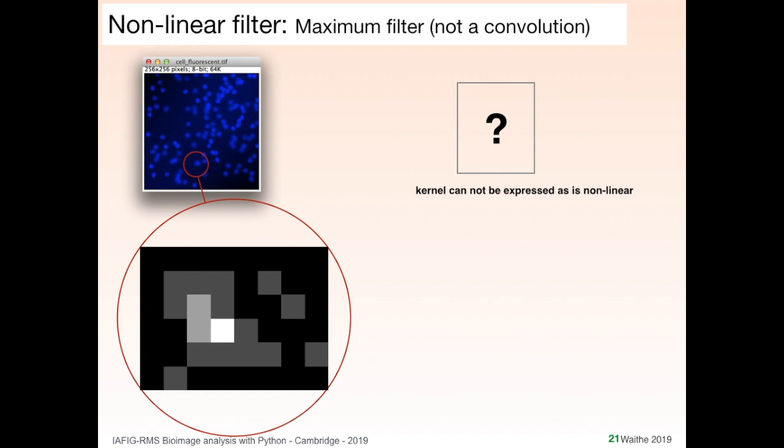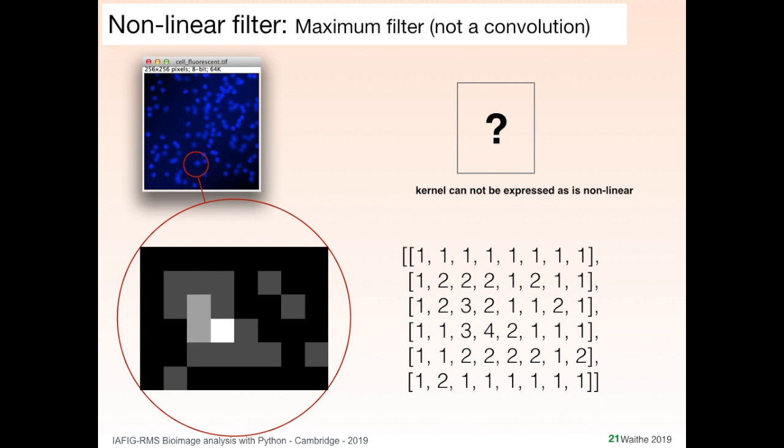What you really need to understand is a little bit about how it works. What we're going to do is take a small part of this image, which I represent like this, and we're going to apply the filter to this and see how it works. So imagine this little grid here from the image is just a 2D array of numbers.